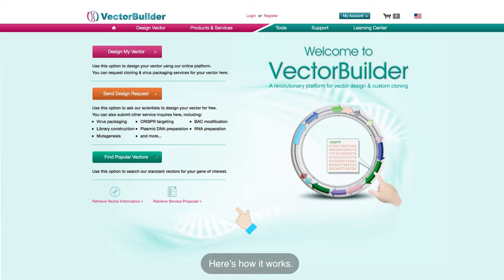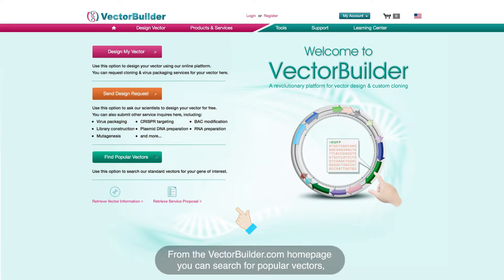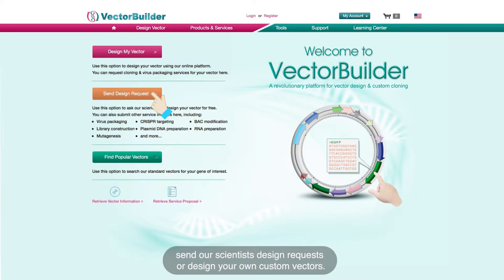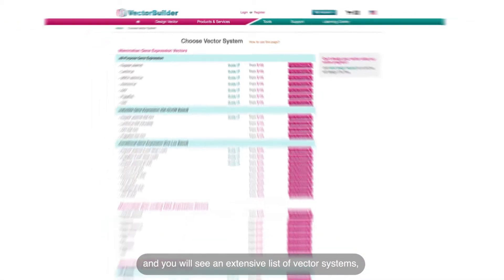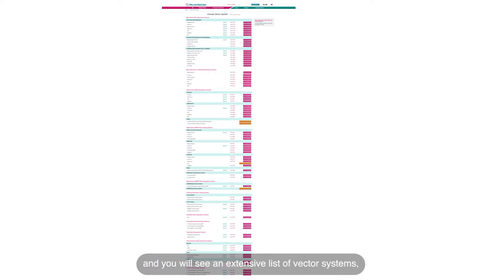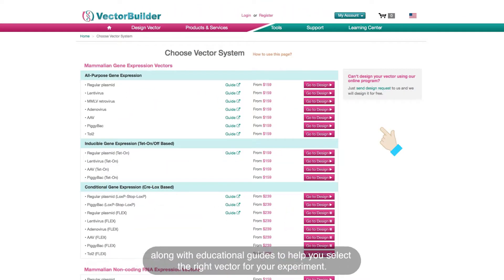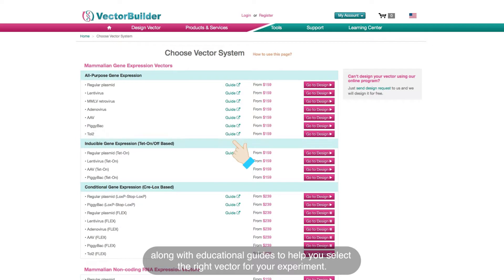Here's how it works. From the VectorBuilder.com homepage, you can search for popular vectors, send our scientists design requests, or design your own custom vectors. To design your own vector, click Design My Vector, and you will see an extensive list of vector systems, along with educational guides to help you select the right vector for your experiment.